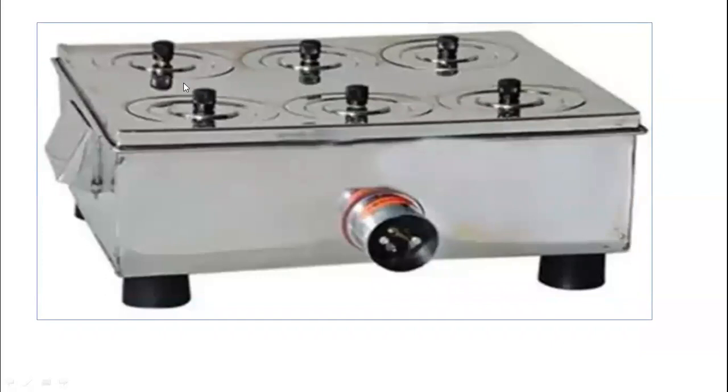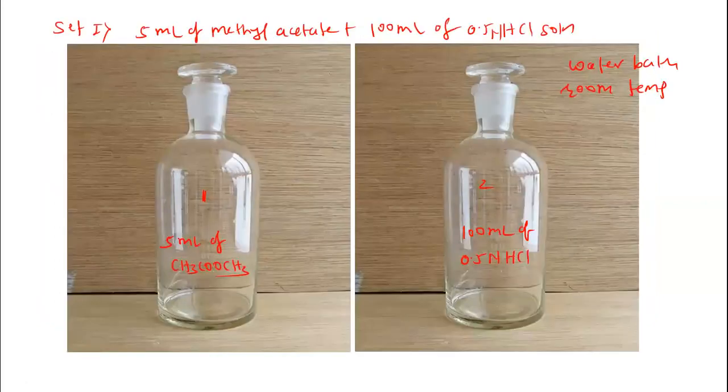In this water bath, we have to keep the two bottles to attain the room temperature. Water has already been taken into this water bath, and we just have to keep the two bottles for set 1 in it. We have to keep the two bottles for a minimum of 10 minutes.